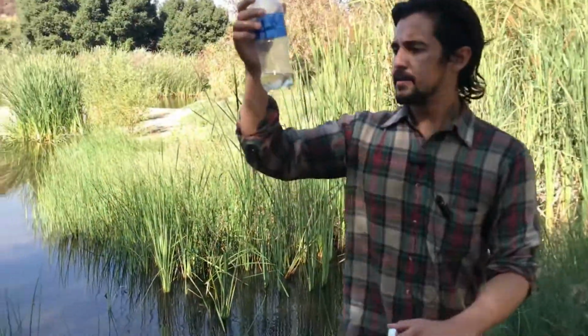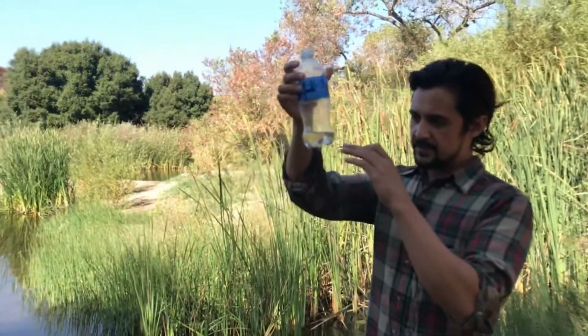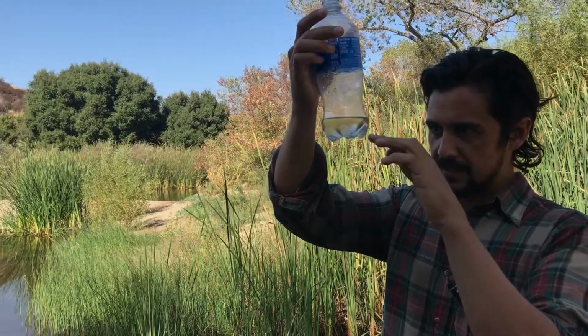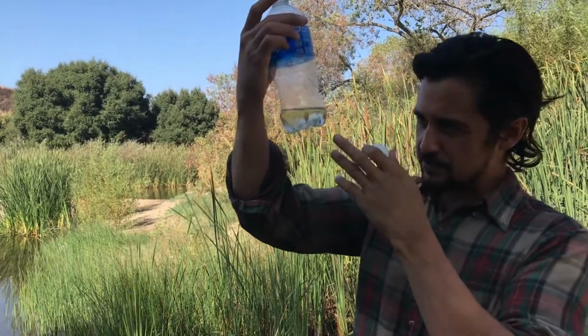So I don't know if you can see it, but this water has a bunch of little specks in it. And already I can see some movement in here. There's little tiny organisms moving around. So these are what I'm going to be looking at using the digital microscope.